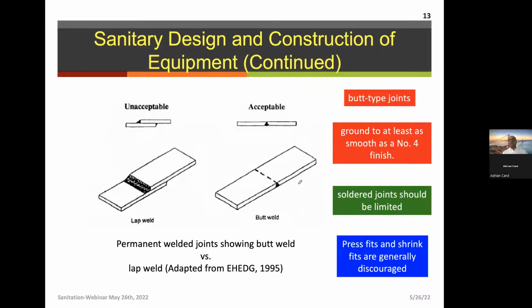Another aspect that I see constantly is welding. And in welding, sanitation, food grade welding, it is critical. I showed you an example before in which we had this lap welding going on, and this is paradise. This is where I can go and find any kind of organism. And if I have a swabbing system and I have not trained my individuals to treat sample here or sample here or sample here, if somebody then goes and combines all these, the measurement that I'm going to get is quite different.